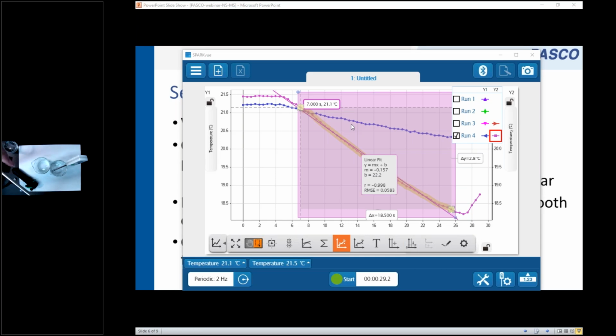And actually, it's a smart idea to put the sensor first into the 1-hole stopper and then put it at a reasonable distance. Hold on. It's difficult to get that sensor in there. Okay, leave at least a couple centimeters out.